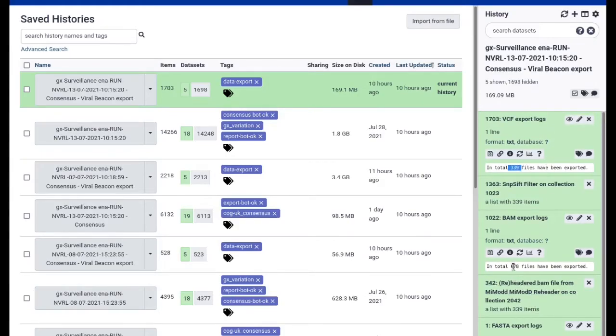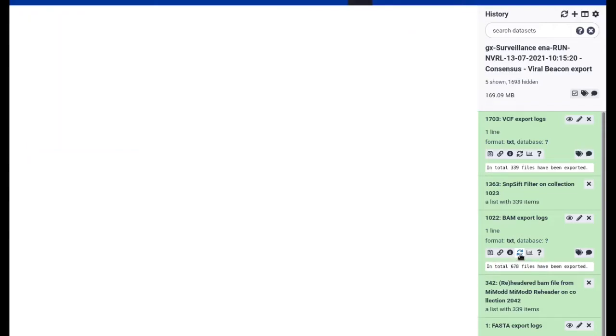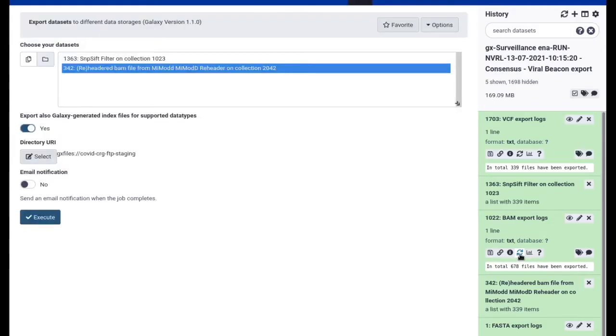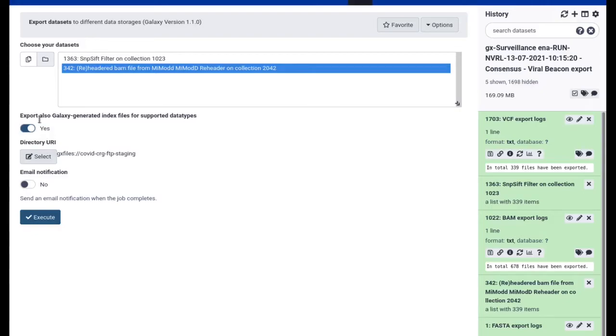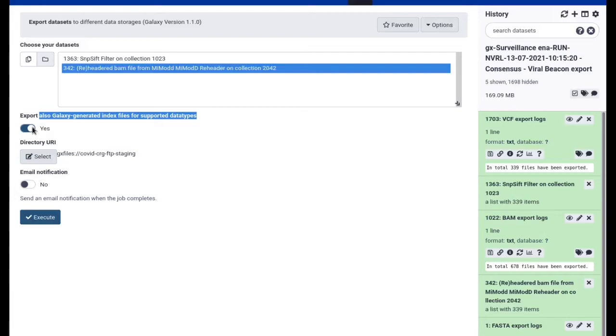You can see that in that case it exported 339 FASTA files, 339 VCF files, and actually twice the number apparently of BAM files. But this is because of the export indices option. I selected in that workflow to export also Galaxy-generated index files for supported data types and I set this to yes. That means that not only the BAM files in that collection of aligned reads but also their BAM indices will get exported.